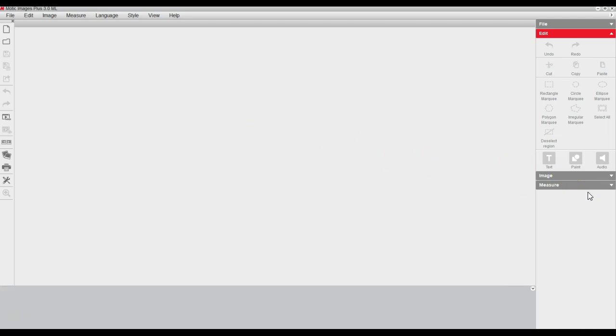And when you're working with the Motic camera in lab, the first thing you always want to do is to calibrate the measurements. If you don't do this, then your measurements on your specimens won't be right. So we need to create a standard to which the computer can measure something of known value, so then it can compare any other specimen that we take pictures of and then try to measure the diameter or the area or whatever we're trying to measure. We can compare that against something that we know for sure. So let me review how to do that.